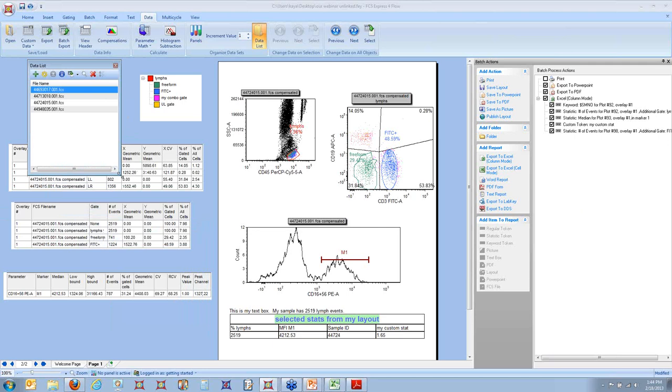Okay, great. So, before we start wrapping things up, I just wanted to mention a few things that I didn't have time to go over today. FCS Express has quite a few features that we actually didn't touch on today. And one of them is compensations. Many of you probably these days are acquiring your samples with compensation. And with FCS3 format files, that compensation is a keyword in your file that you can choose to apply or not. So of course we can read those compensations.